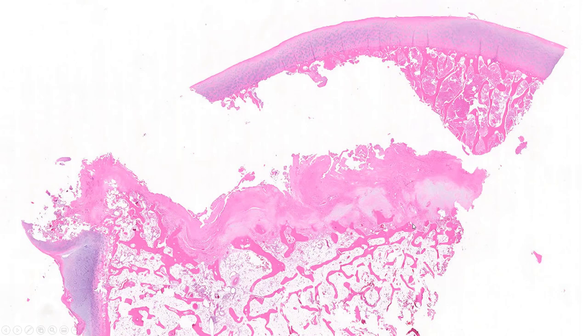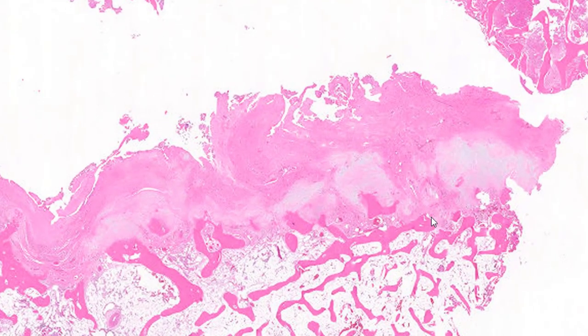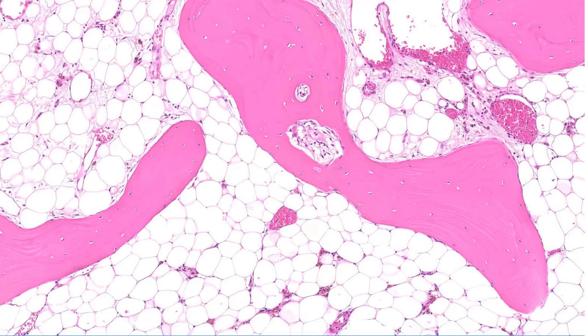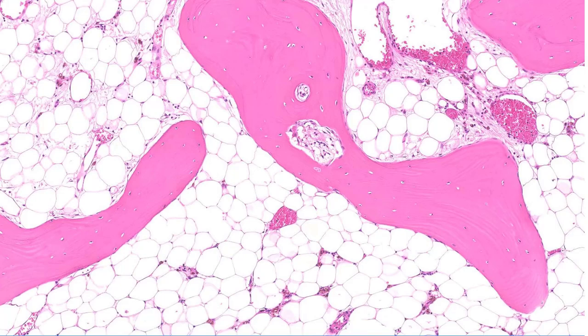Let's turn our attention from the surface to the base of that wedge-shaped lesion — this is the interface between the living and the dead. You can see fibrocartilage-like material here. Notice this is all living; anything above this was all dead. Here's the reactive bone at the interface. This bone beneath the interface is living lamellar bone, because you see these parallel lamellae. There is some remodeling in the sense that there are a larger number of osteocyte nuclei than you see in normal bone. The marrow space is living and not dead, unlike the most superior bone we just saw.